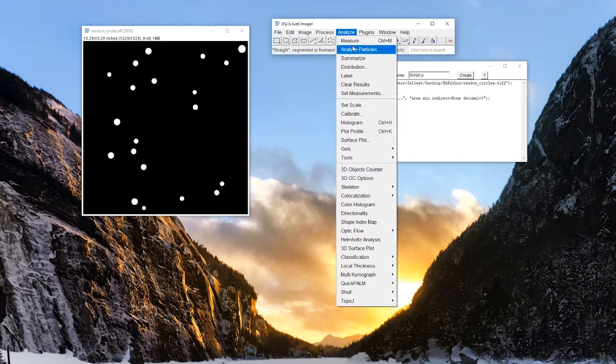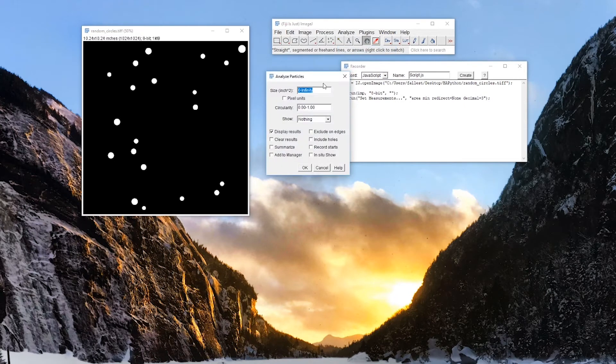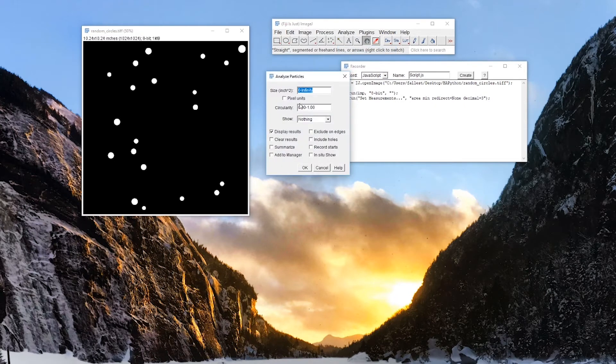And now, let's see, we can analyze particles. Display results. Okay.